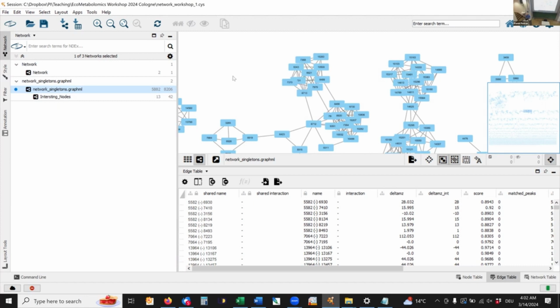Other questions so far about Cytoscape? Okay, you all managed to download it and you all managed to drag and drop into Cytoscape and see now this network. Okay, cool. Then maybe let's start fusing in data before we go into the style. So we just have our data frame complete. And then we can do some visualizations such as the pie charts Giovanni showed you already yesterday.